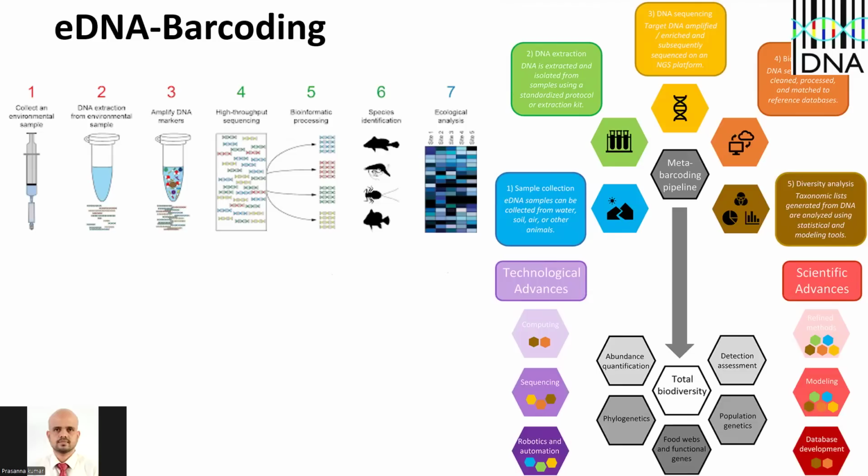So the entire aquatic ecosystem, soil, or air is actually filled with DNA which can be trapped, extracted, and PCR amplified. In the PCR, you can decide whether you want to study bacteria, put a 16S rRNA primer. If you want to study the plant ecosystem of seaweed, seagrass, mangroves in that patch, you put rbcL and matK primers. If you want to study vertebrates, invertebrates, go for COI primers.